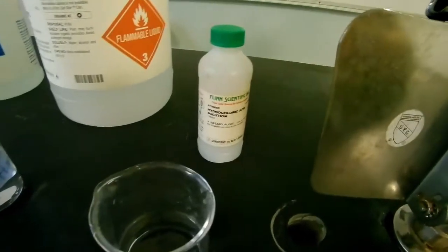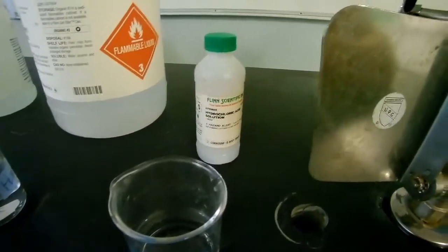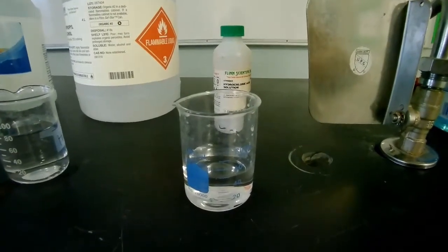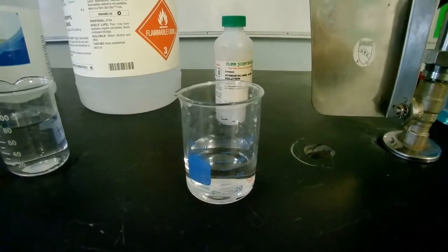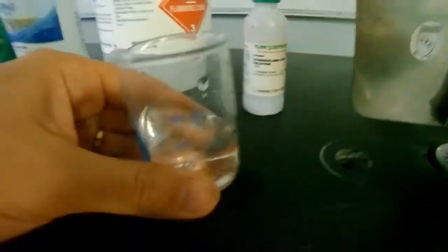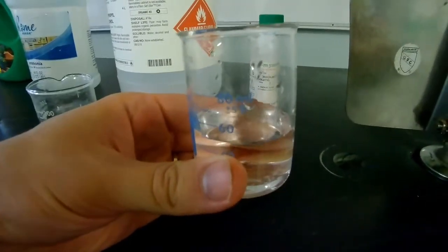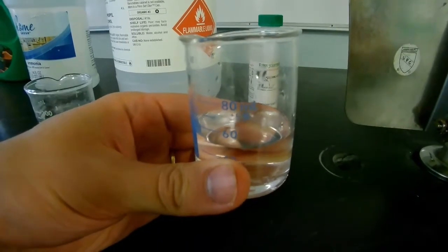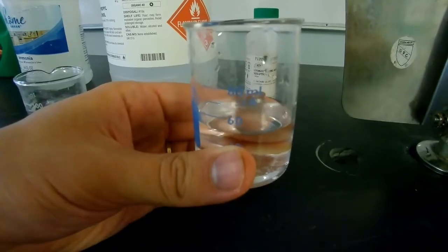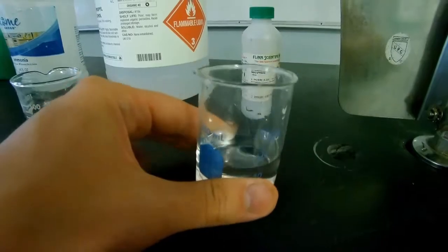And our last substance that we're going to test is none other than hydrochloric acid. This is usually pretty dangerous stuff, and I don't break it out when students are around, but hey, if I'm filming things in my off period with no students, I can break out whatever chemicals I want to. So this is what it looks like. It's a clear substance. I know I'm handling hydrochloric acid without gloves. Do as I say, not as I do. It's okay. This is not concentrated enough to actually burn me, unless I got it in my eye or something, which is why I'm wearing goggles.